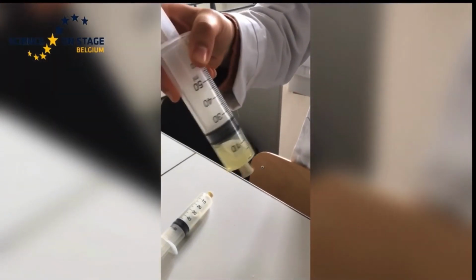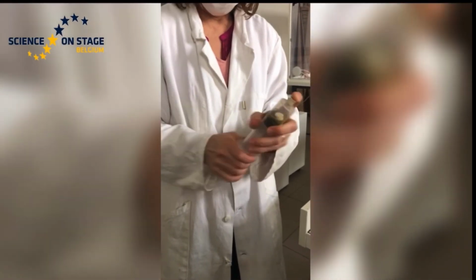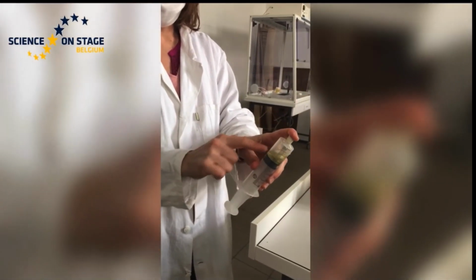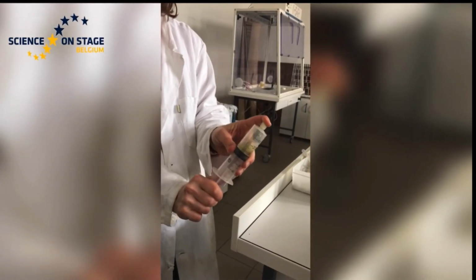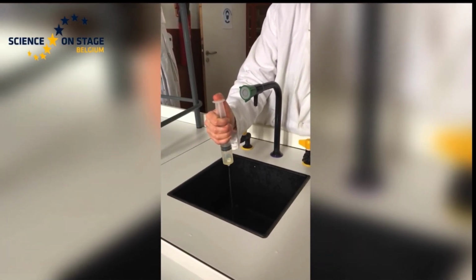The reaction is rather slow. It's necessary to help it a little by creating a depression. One sees bubbles forming especially on the rubber of the piston. And we eliminate only the liquid after, and not the gas. It takes time. You can let it run while you explain the next part. Keep the gas and eliminate the liquid.